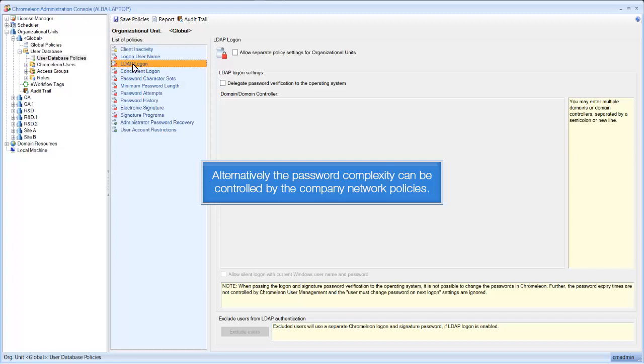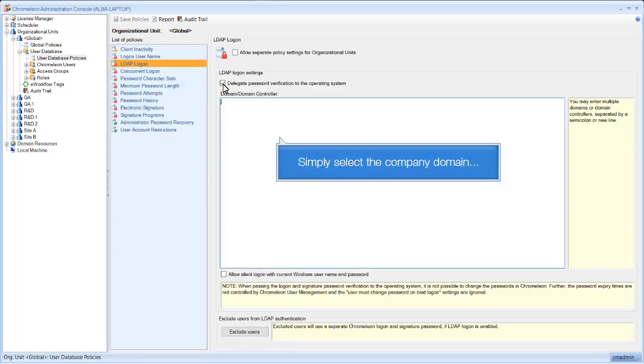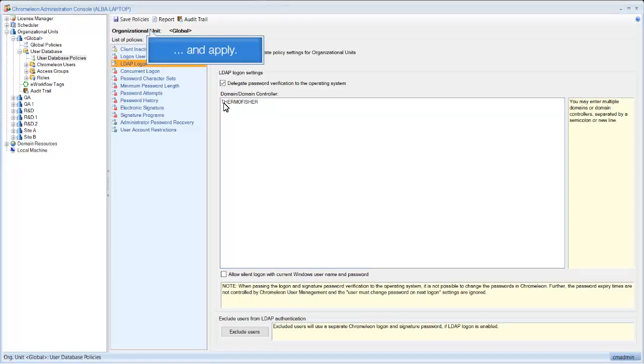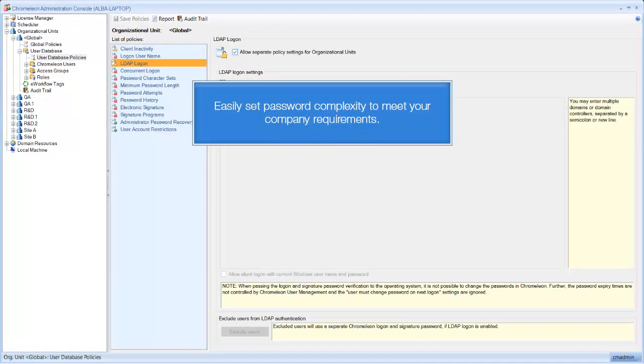Alternatively the password complexity can be controlled by the company network policies. Simply select the company domain, and apply. Easily set password complexity to meet your company requirements.